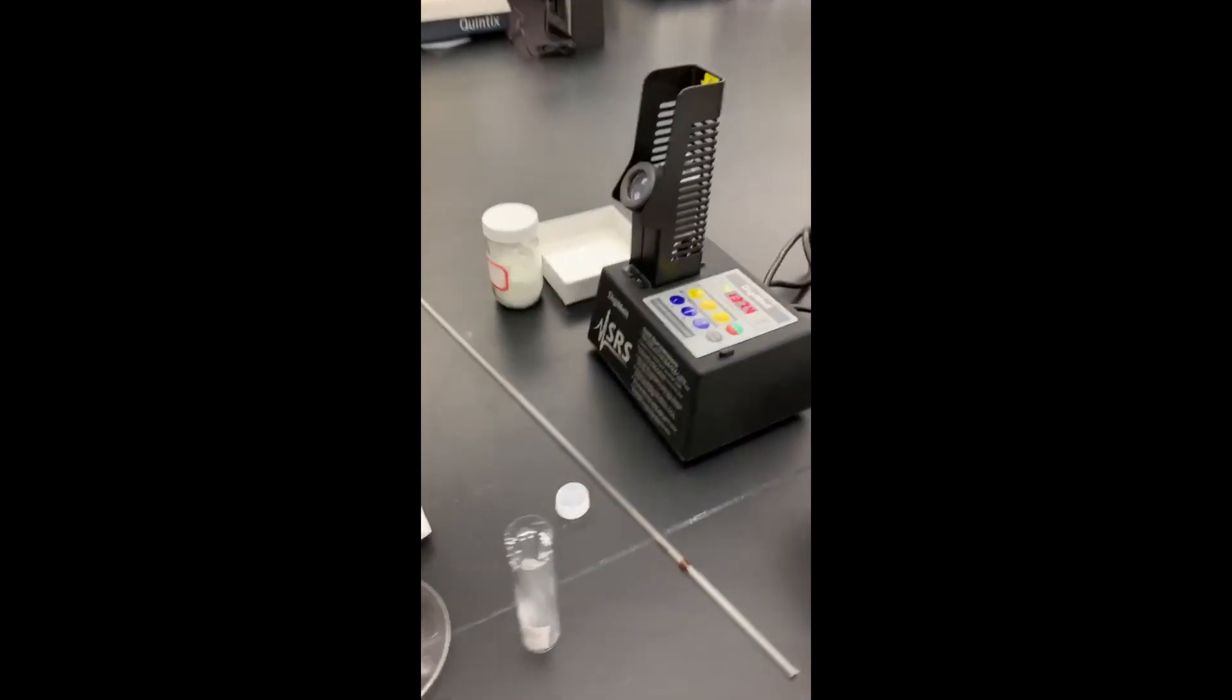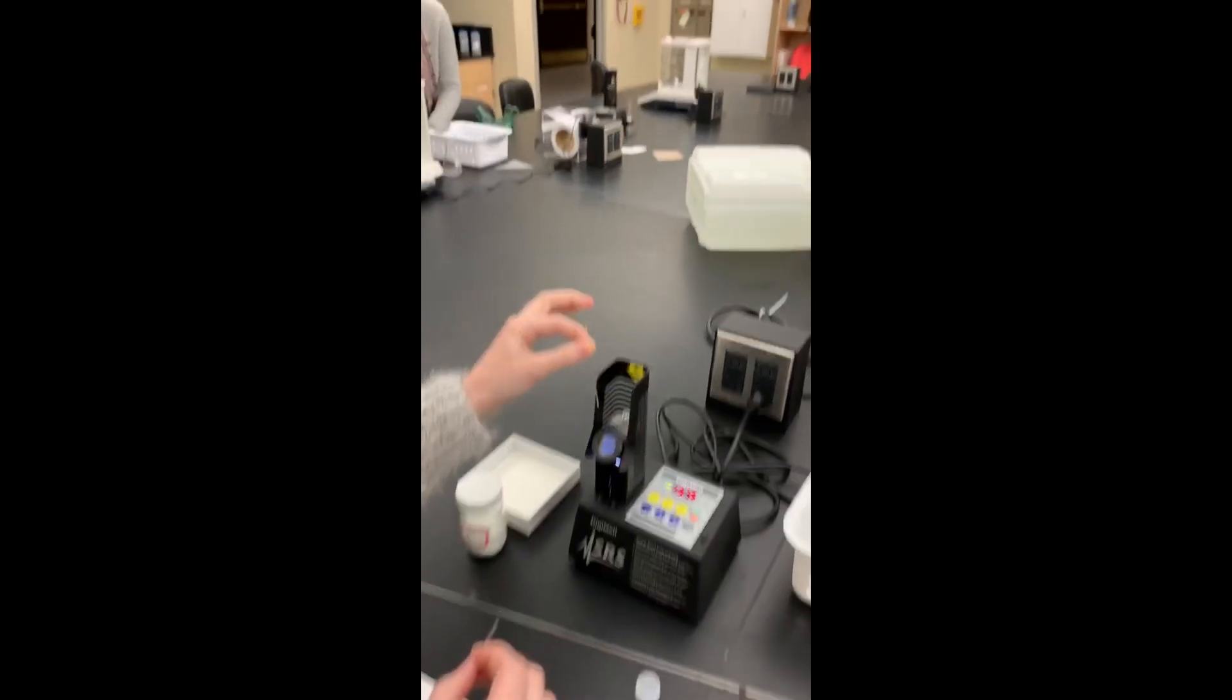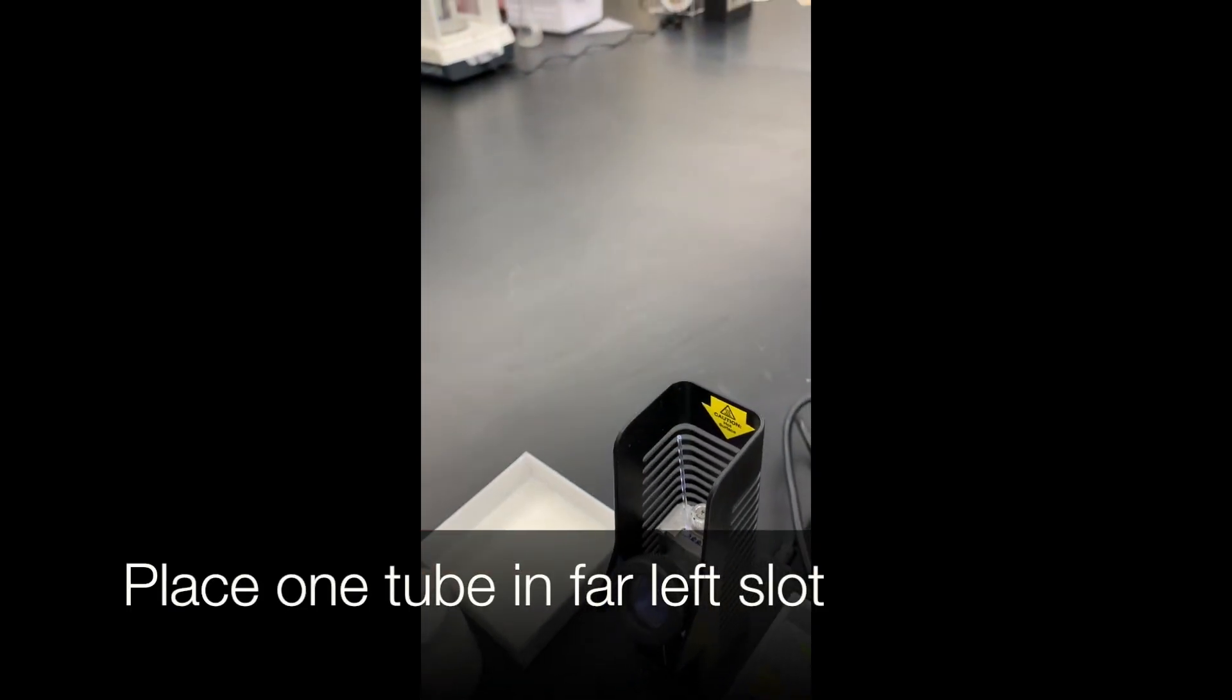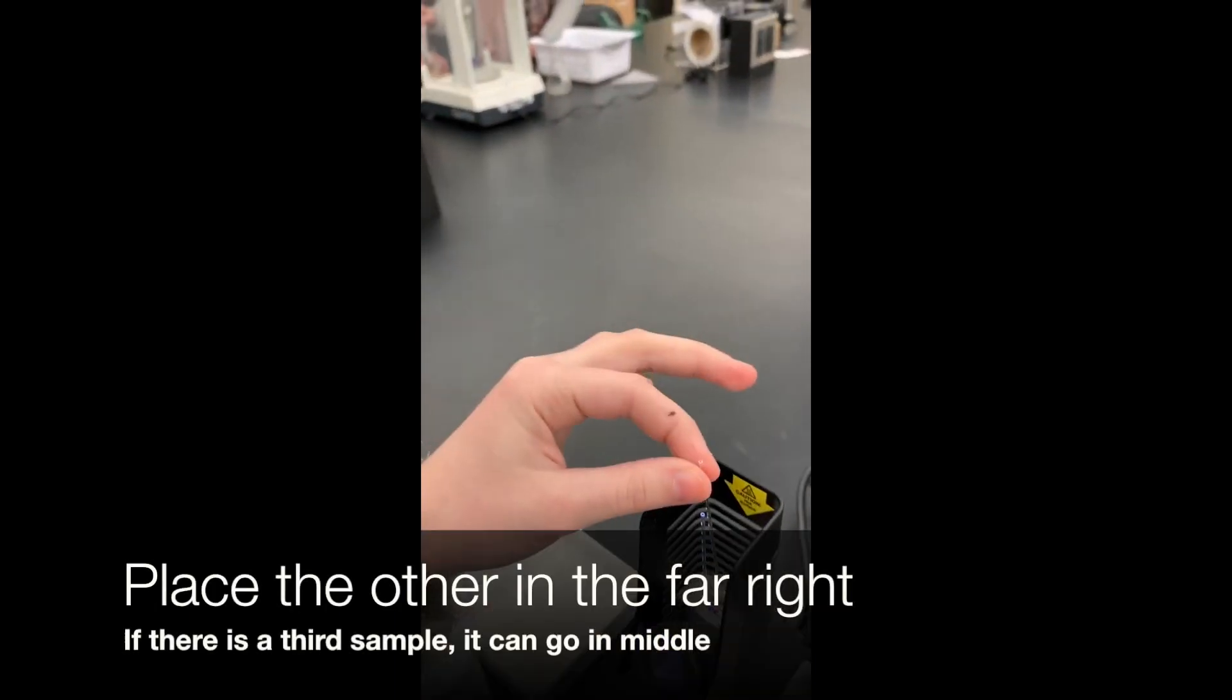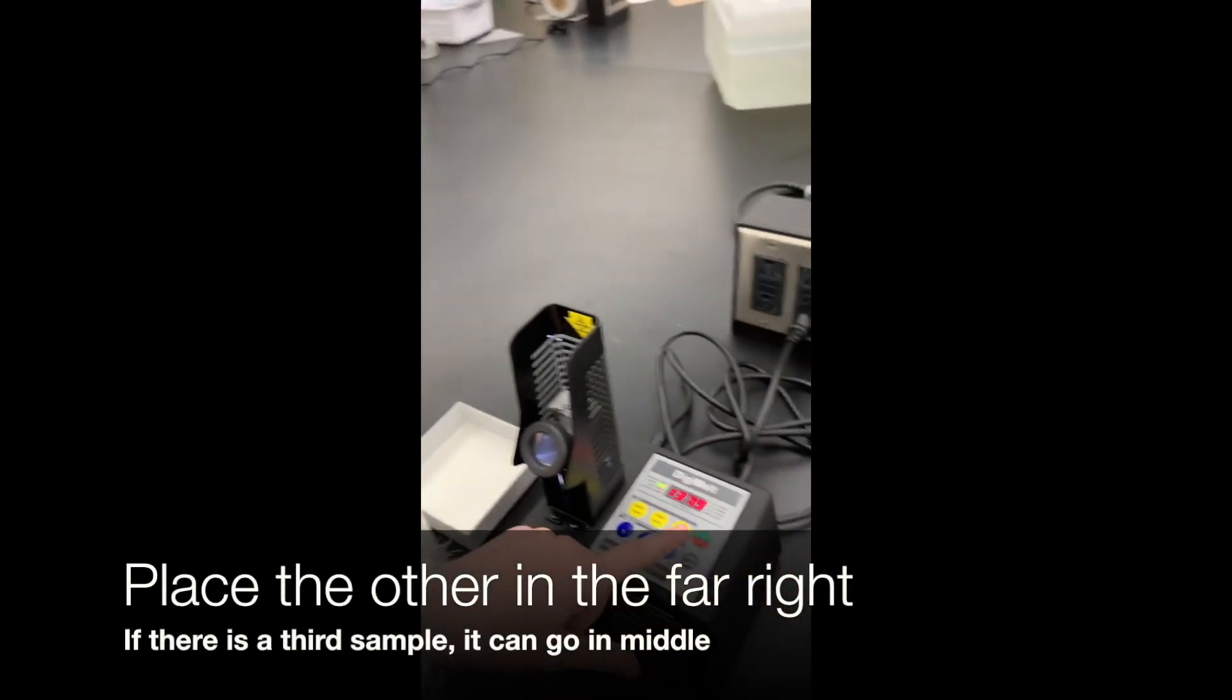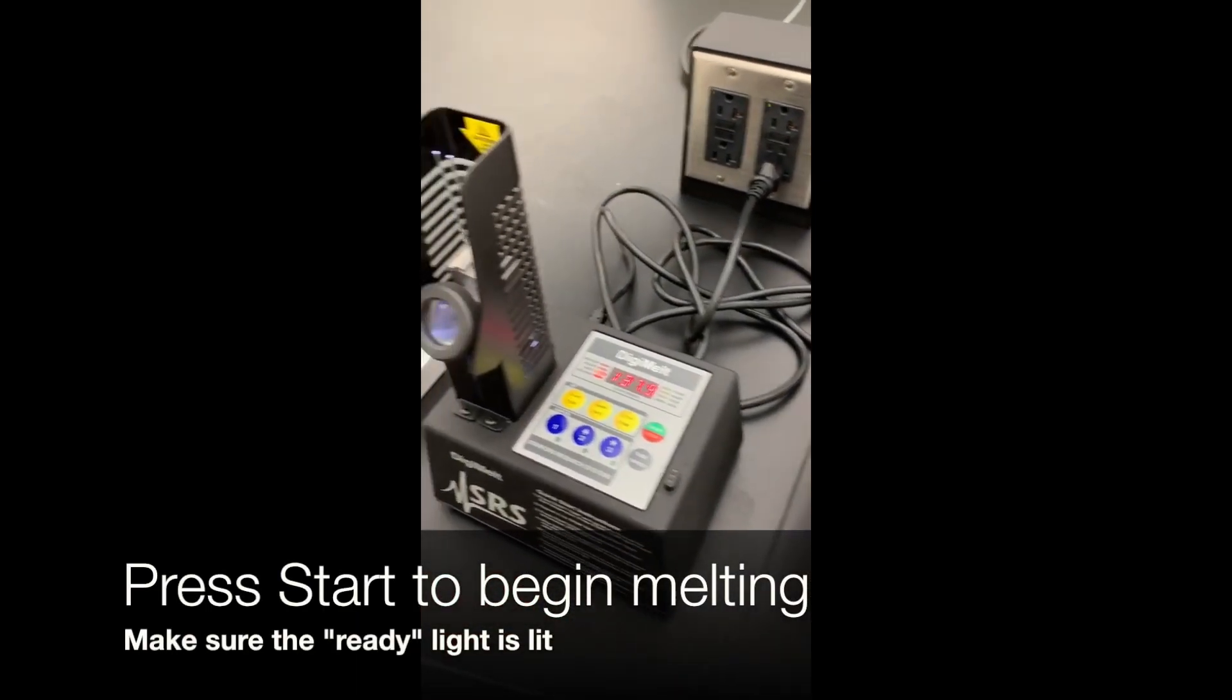Have a pen and paper ready for the next part. When the ready becomes lit on the melt temp apparatus, insert the capillary tubes into the oven. We will insert one on the far left and one on the far right so they are easier to view, but a third sample could be inserted in the middle. Once the samples are in there, press start to begin the ramp.